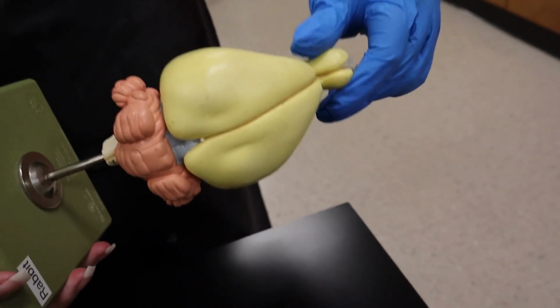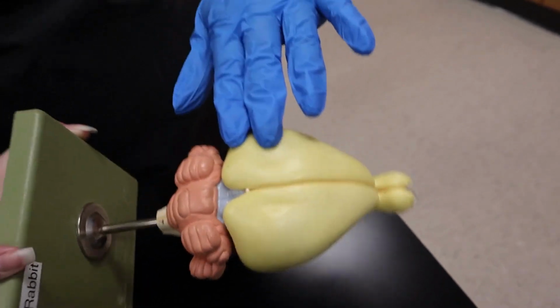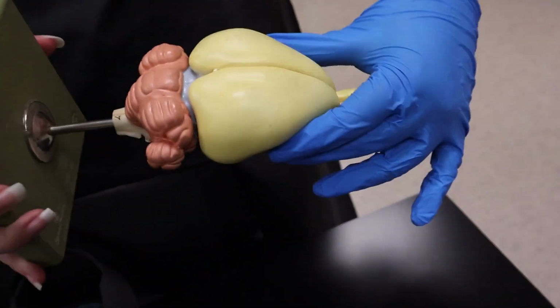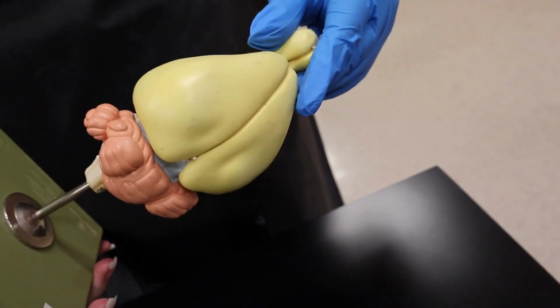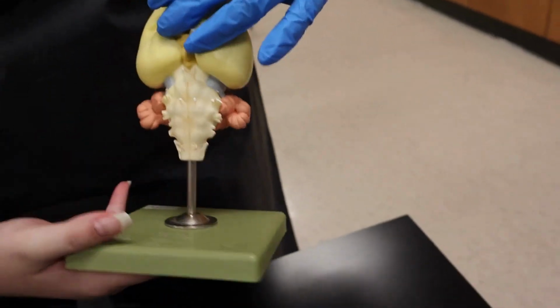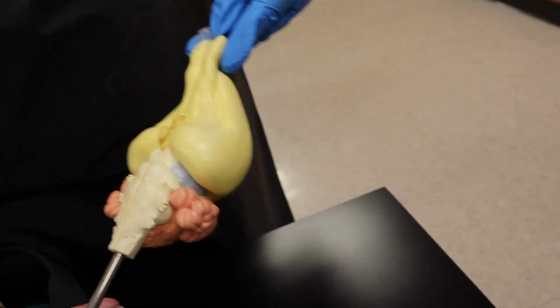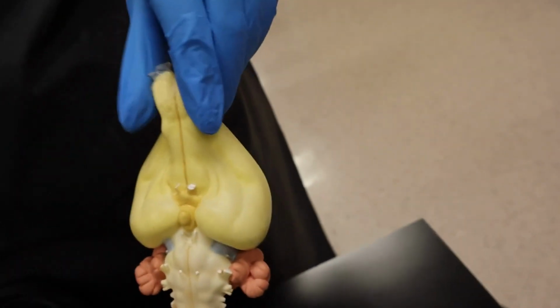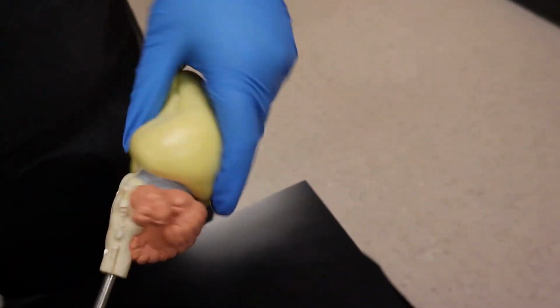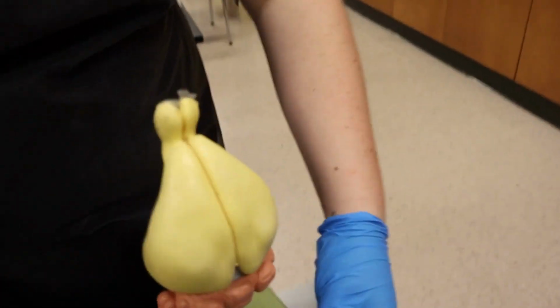It's super essential in skeletal muscle contractions as well as voluntary movements, along with learning and perception. So this is going to be the main thought pattern, allowing animals to think, as well as most mammals, as well as humans. Alright, so the anterior part of this yellow cerebrum is actually known for its olfactory bulbs, the smells, which are going to be up here, that help smell, along with how our midbrain, the optic lobes, help sight. So they all have very different functions and are super essential in adaptations to allow rabbits to survive better.